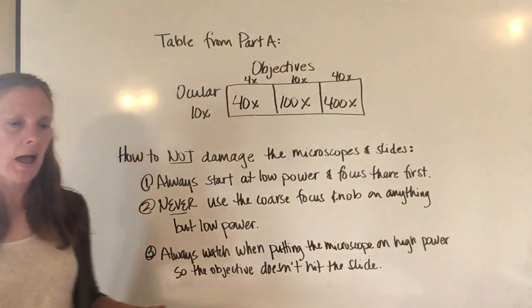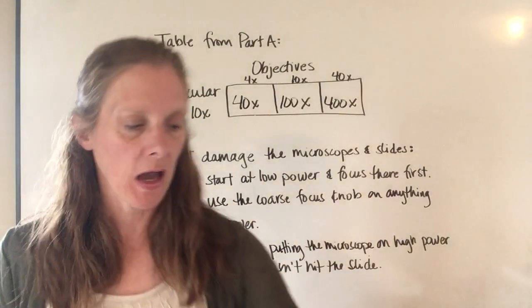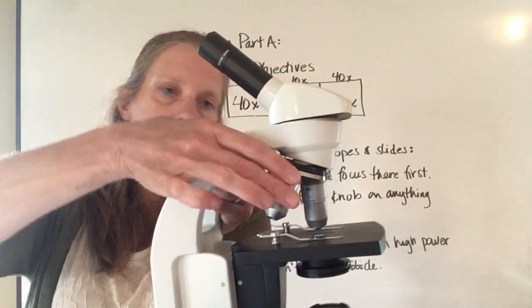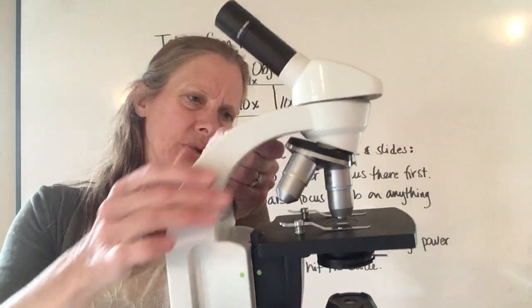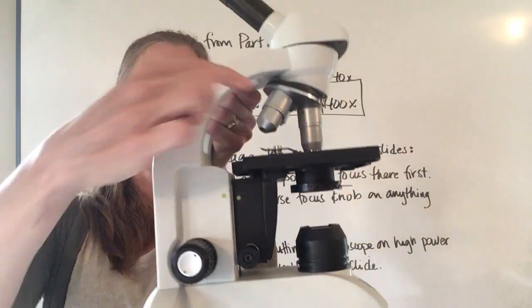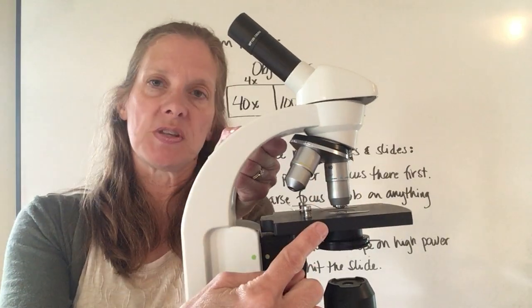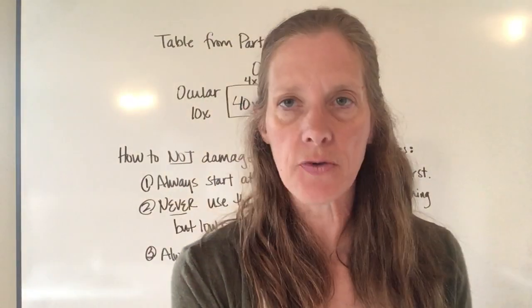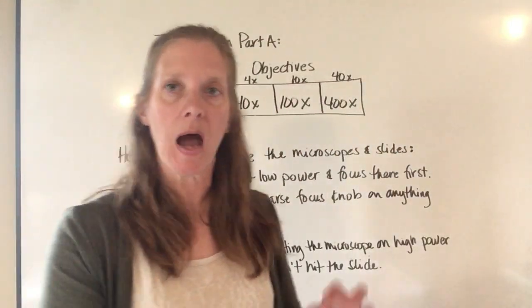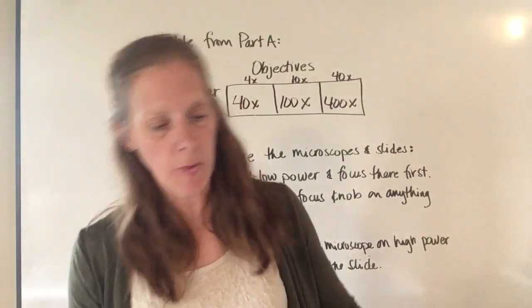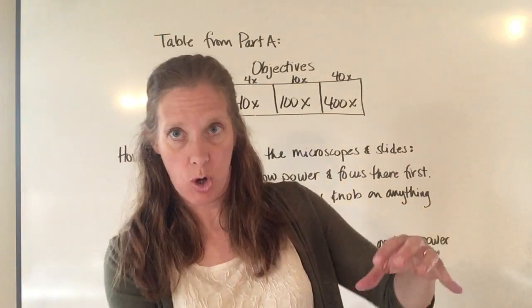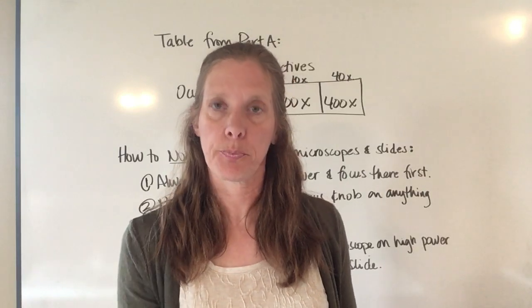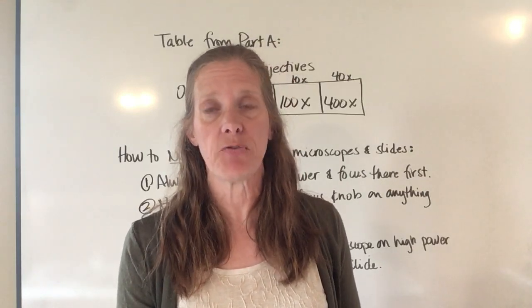Finally, as you're turning this nose piece to get your microscope into high power, you can see just how close this lens, the objective lens, is to the stage. If there's a slide on here, it's that much closer. Every time you put the objective on high power, make sure you're actually looking at the microscope from the side.